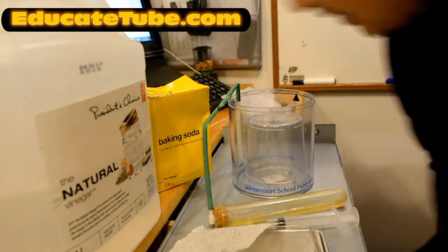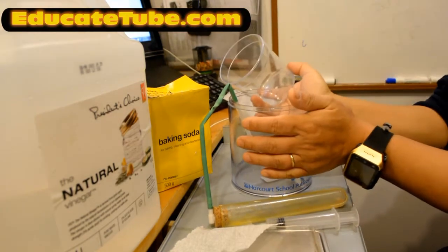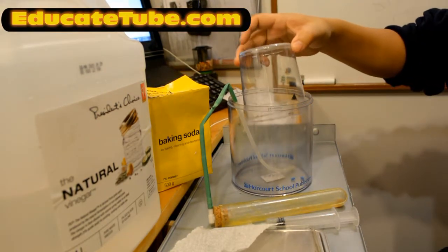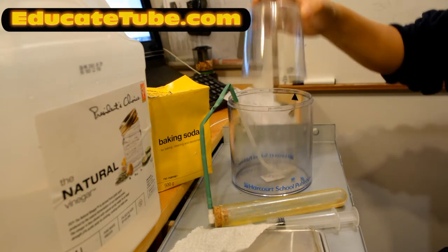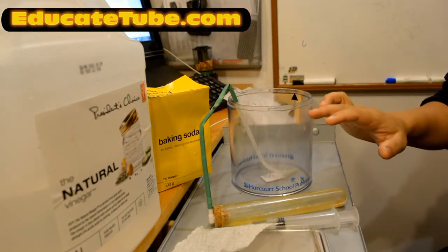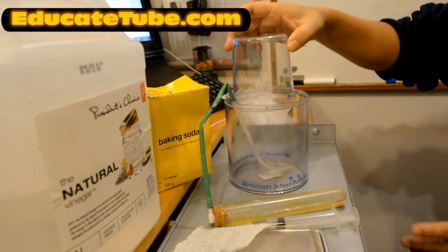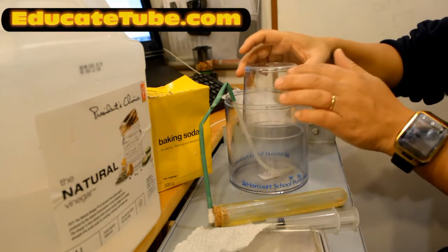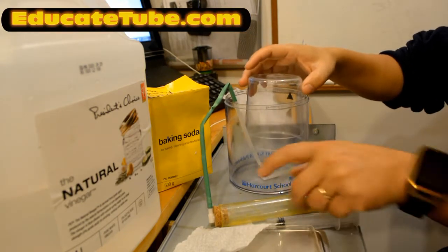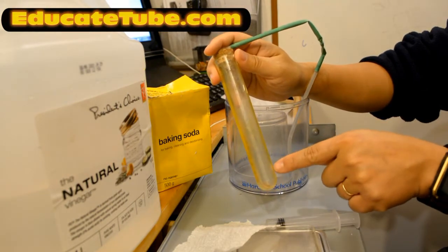This is basically a displaced volume container. It comes with the large container cylinder, and then you have the other cylinder. Now this is upside down for a reason. What's going to happen is I'm going to fill this up with water, and I'm going to fill up this with water. I'm going to turn around like this, and both of them are filled with water, except this is upside down.